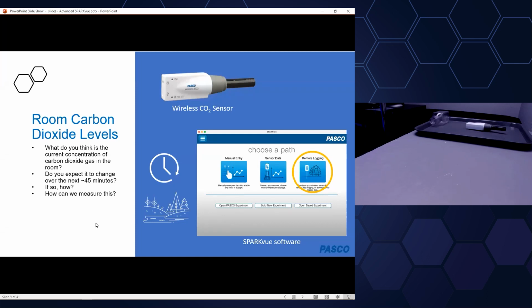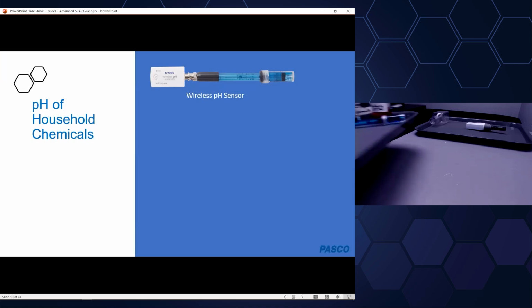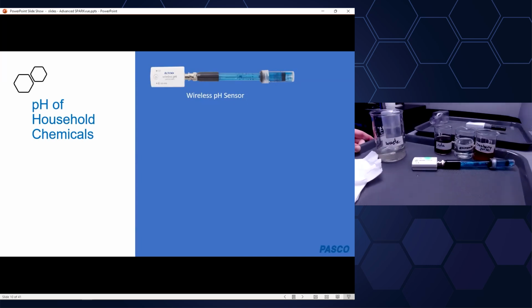So we're going to revisit this and see if some of your predictions for the CO2 level over this webinar come true. All right, so let us jump into the next activity while CO2 is logging there in the background. And this is an investigation of the pH of household chemicals. So let me bring my setup over here and give you an introduction.